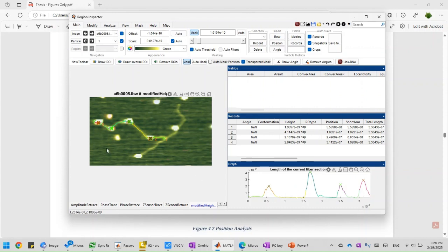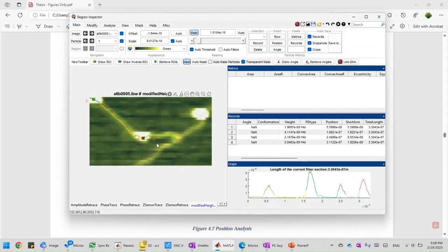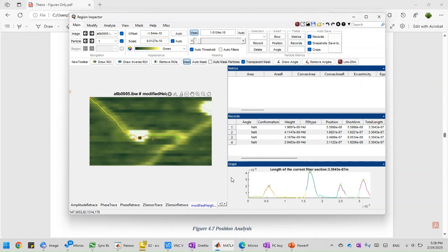If I zoom in on, let's say, the first peak, I have the green label, which is the very first section. And now I have the orange one, which is from 2 to 3. That's the entry point and exit point of the first protein complex. So it automatically does that for you.